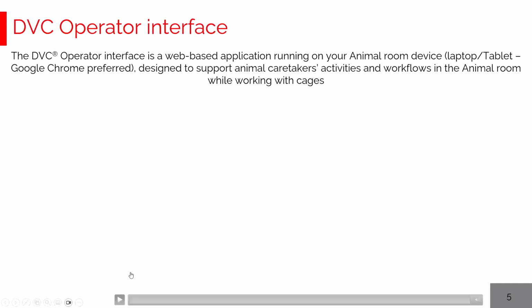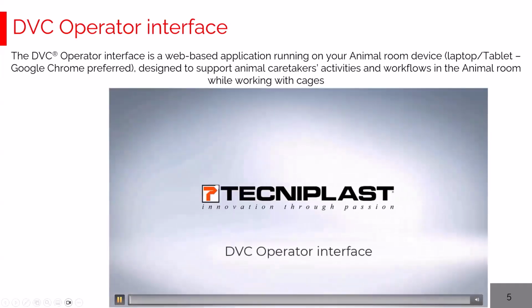Now I start sharing one of the several videos we prepared for you, explaining a little bit more in depth this interface.